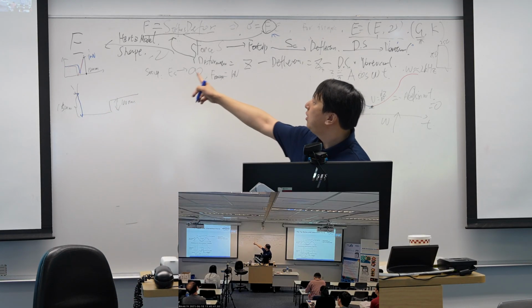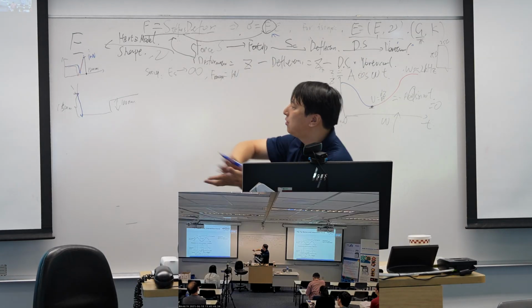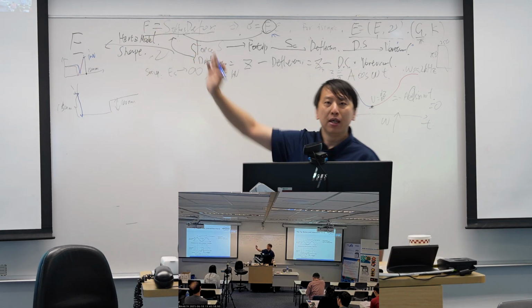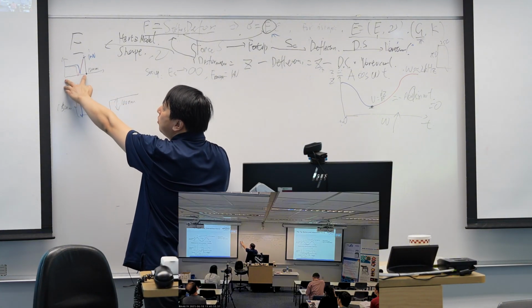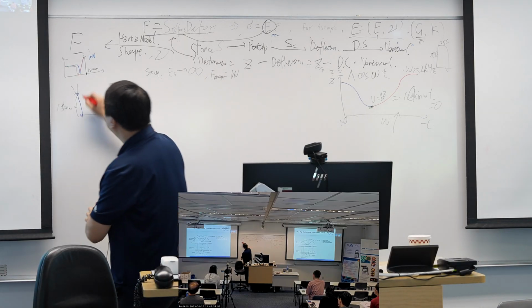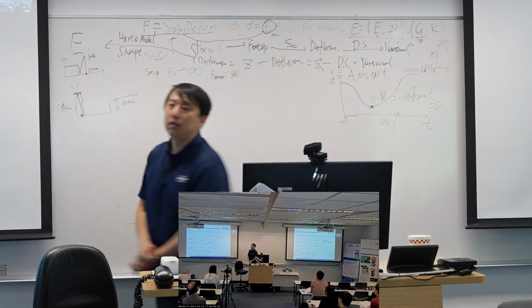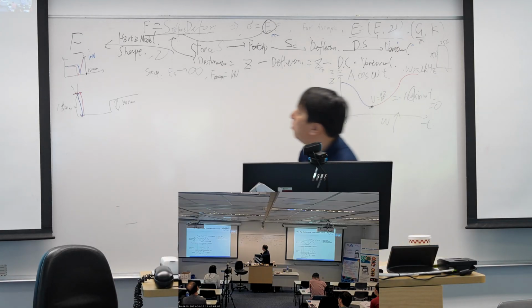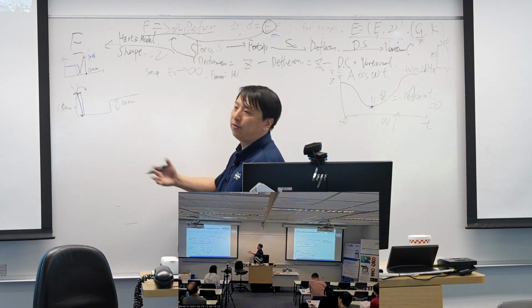Since my sample is infinitely stiff, once the probe touches the surface and reaches 1 nanonewton, it will move back. I set up my move back to also be 150 nanometers. So once it moves back, it's also here. And then I make my probe jump to this side for a step.